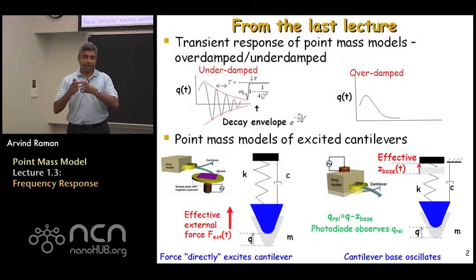If you took the actual cantilever probe with distributed forces acting on it, such as magnetic forces making it oscillate, and the work done by all the applied forces in moving the tip up and down with a certain oscillation amplitude can be equated to the work done by an effective force in the point mass model to move the tip up and down by the same amplitude, then based on this energy equivalence principle we've got a pretty accurate model of the actual probe.